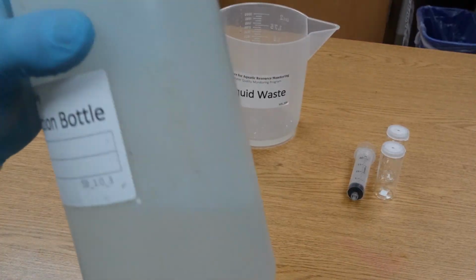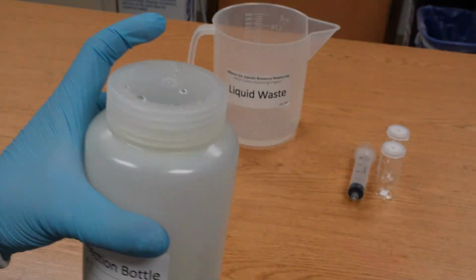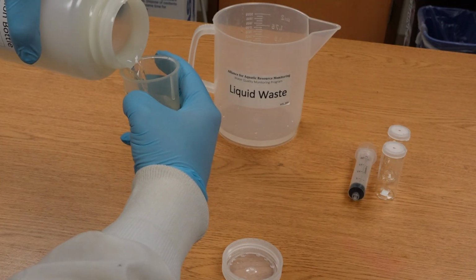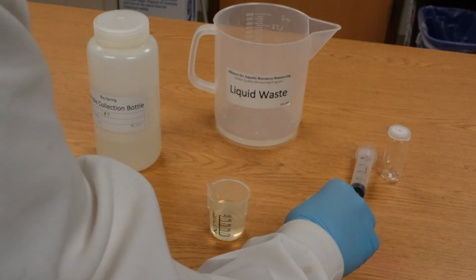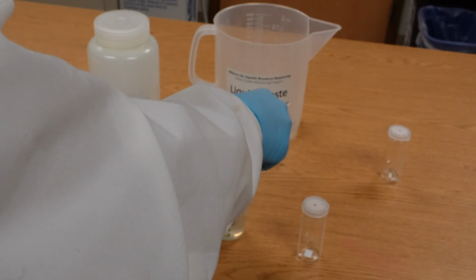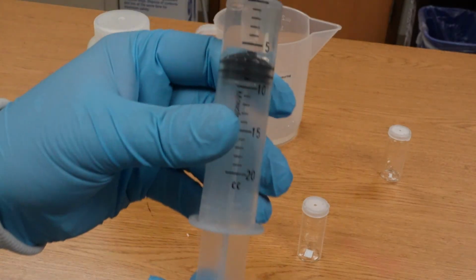Invert the sample bottle 3 times and pour into a beaker, and then use the syringe to draw 5 milliliters of sample water. Please note, if there are air bubbles in the syringe, you must expel them to get an accurate volume.